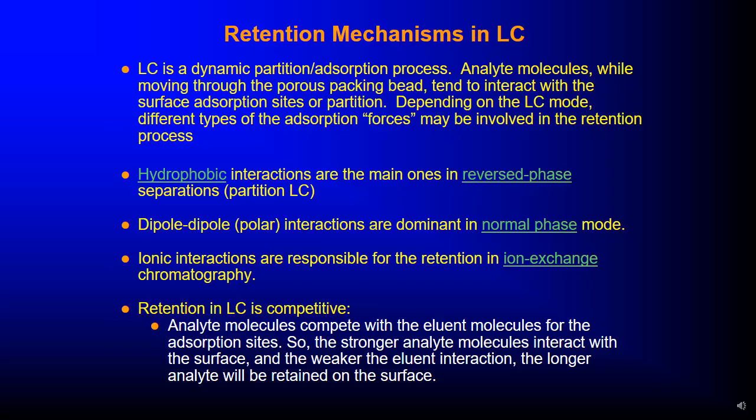So, retention mechanisms in liquid chromatography. Liquid chromatography is a dynamic partition adsorption process. Analyte molecules, while moving through the porous packing bead, tend to interact with the surface adsorption sites. Depending on the liquid chromatography mode, different types of adsorption forces may be involved in the retention process.